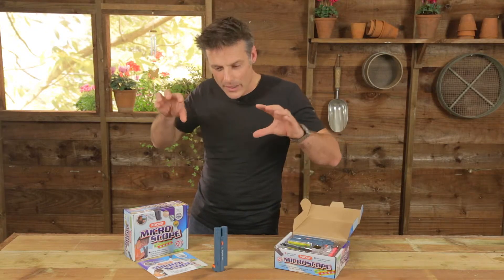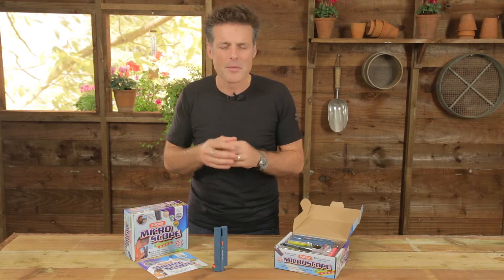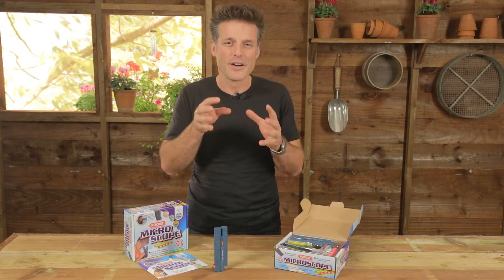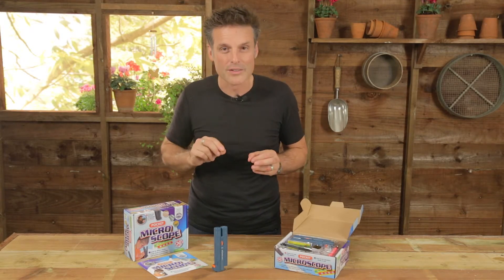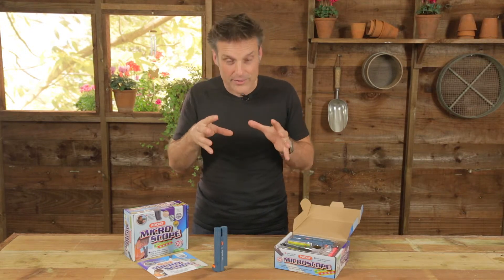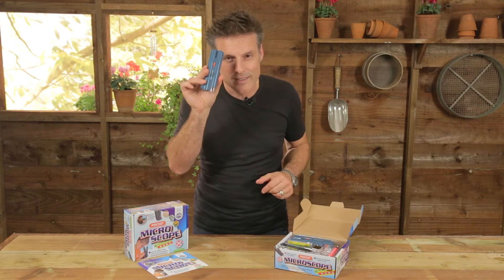It's a really good beginner's way to become aware of this world that is practically invisible to us on a day-to-day basis. And I remember to this very day the first time I literally took a piece of pond water, dabbed it on a microscope slide, and then looked down to see it fizzing with all sorts of weird little googly-eyed alien life forms. It's right there — all you need is the device with which to see it.